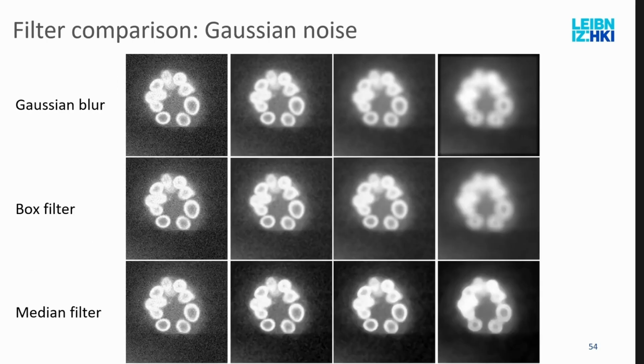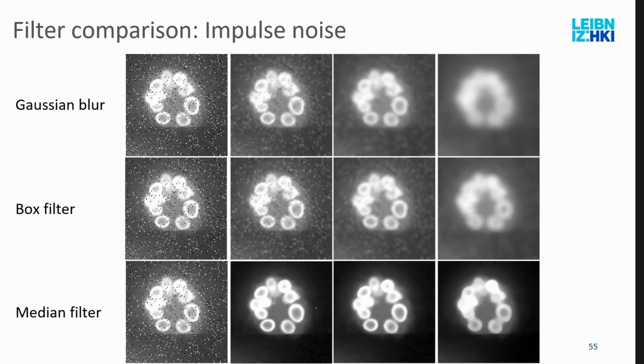Yeah. So, and then we have all these noise removal filters. Gaussian blur, box filter, although I know I just mentioned it, rather go with the Gaussian blur in general, and then the median filter, very good for edge preservation, even if you use a very large filter kernel, very useful. And then with impulse noise or salt and pepper noise, performance varies depending on what you choose. Here you would rather go with the median filter to remove it.